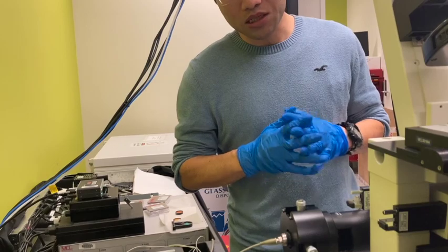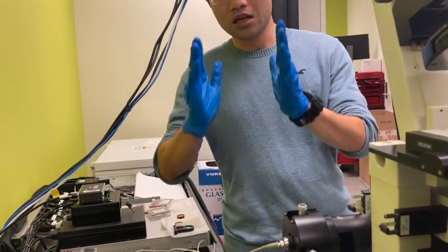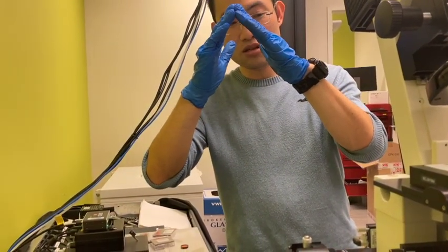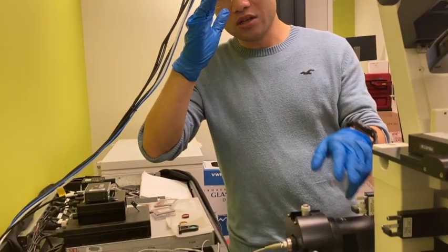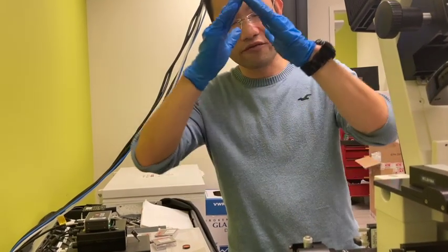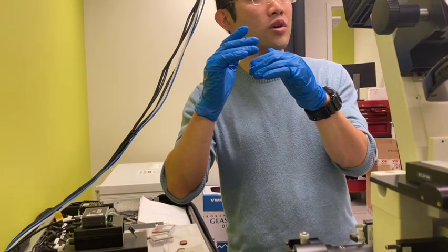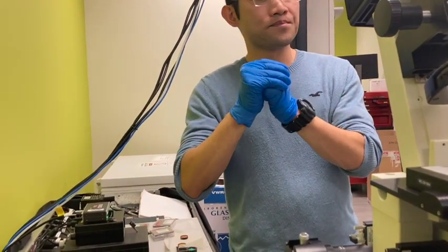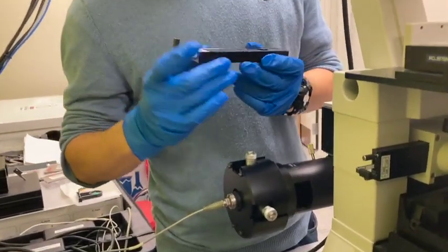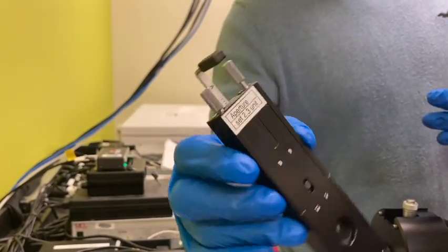It's a little complicated to explain, but you can imagine that light is coming into the objective from an angle. Then this aperture is going to change the angle, so you can form a wider angle or a smaller angle. And this will affect the signal to noise for our IRM. I have already made a label saying this aperture is set to 2/3, and if your signal is going weird, check this one.